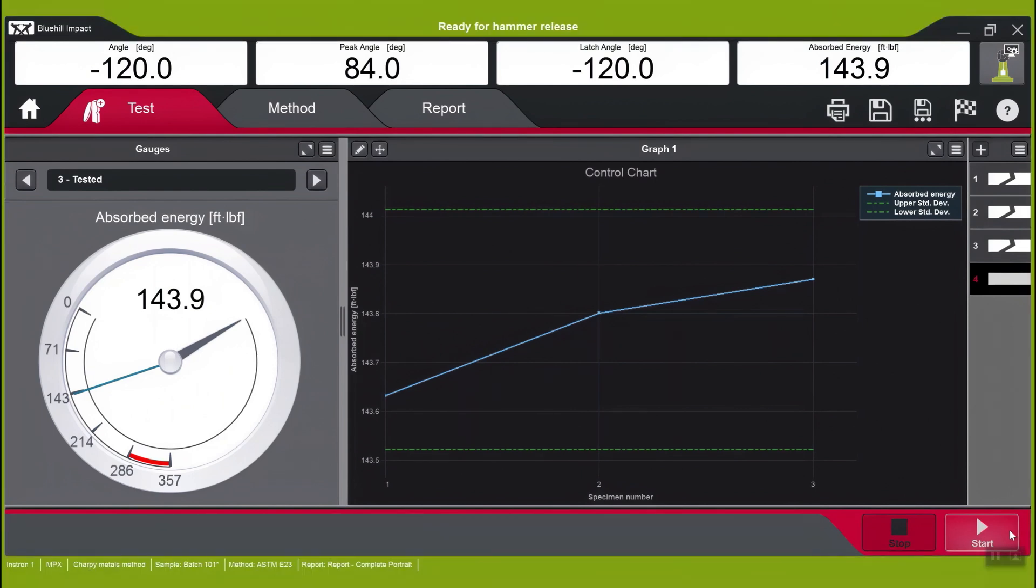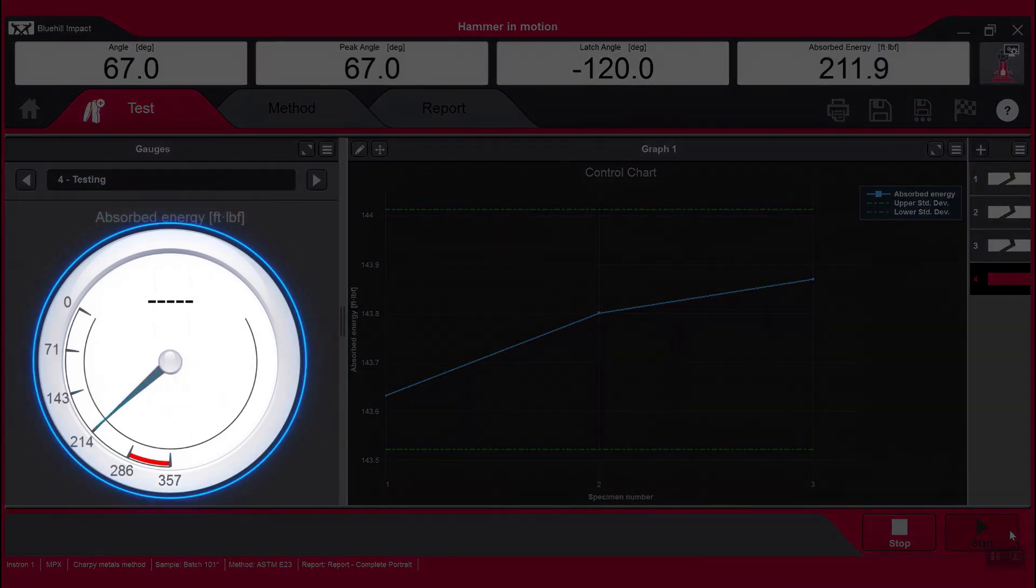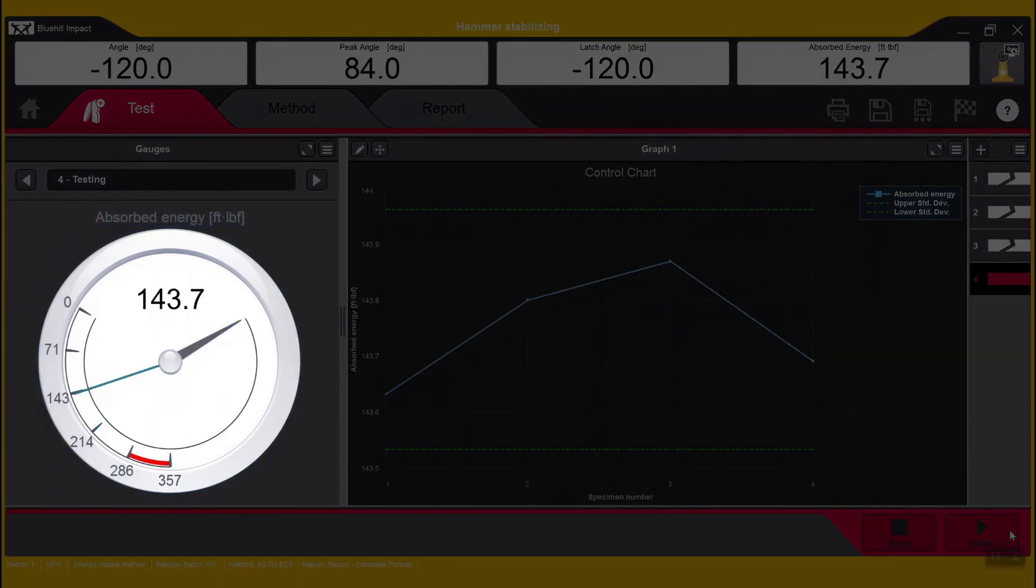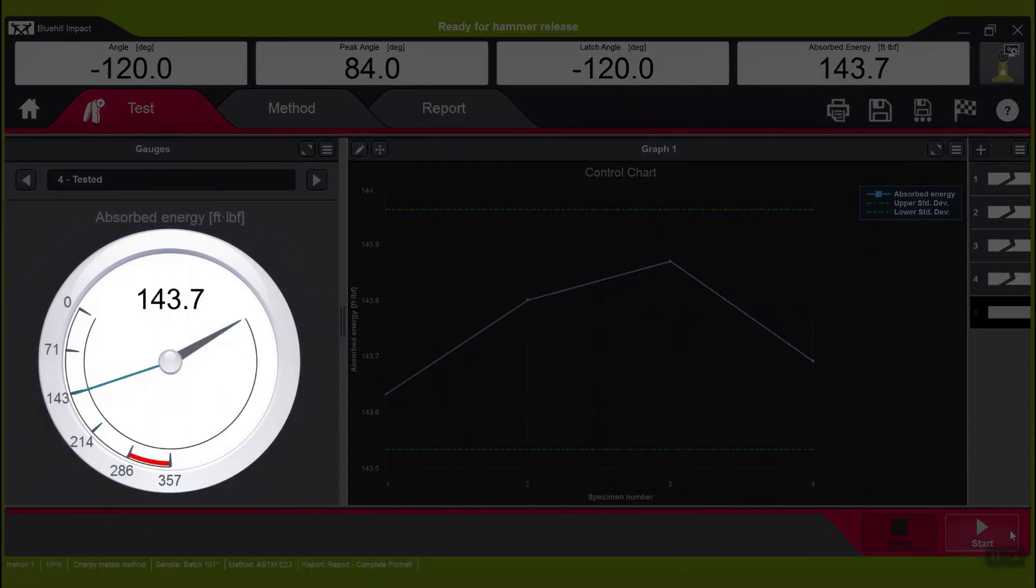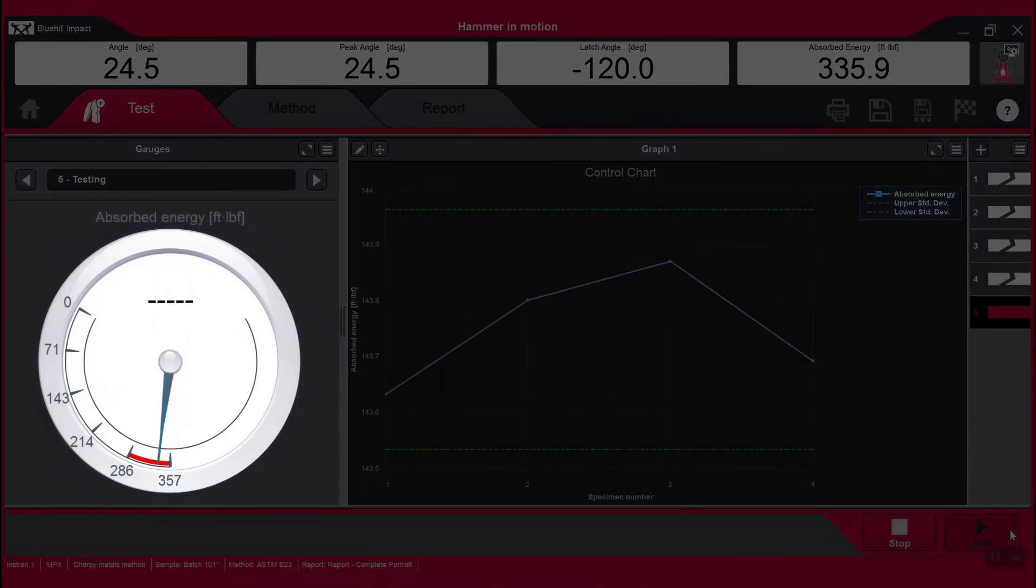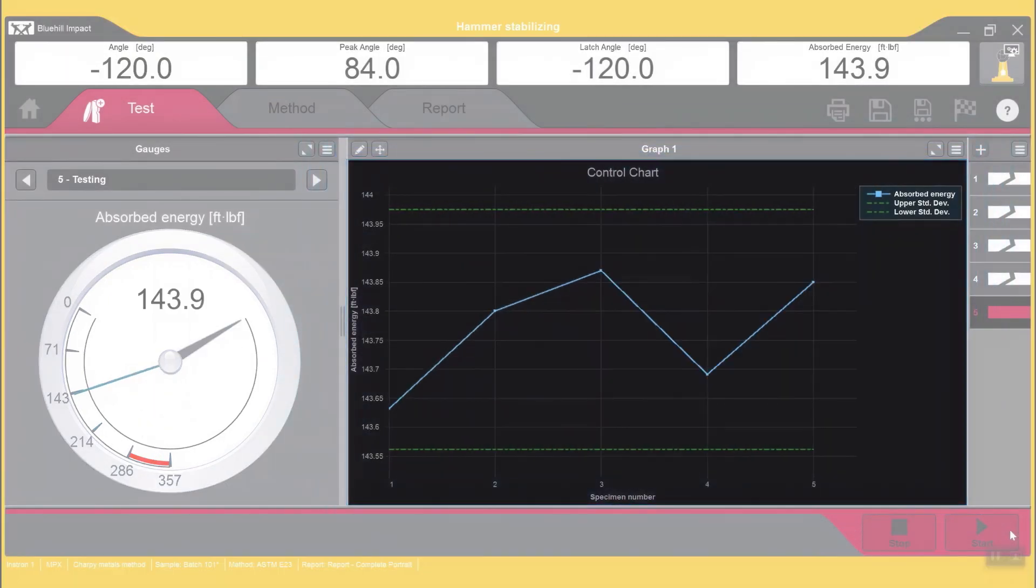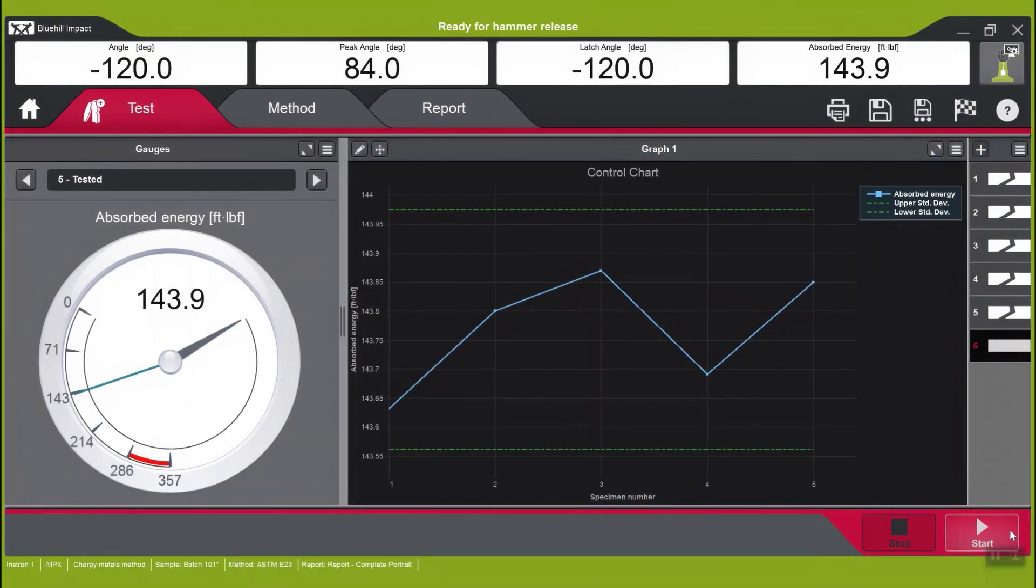When testing, the software displays an analog dial for simple visualization of absorbed energy and a control chart that displays results from the entire batch of testing.